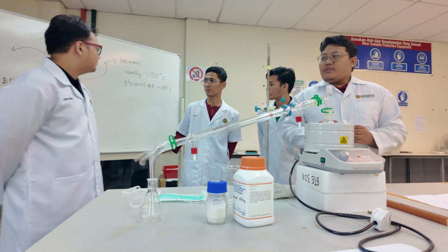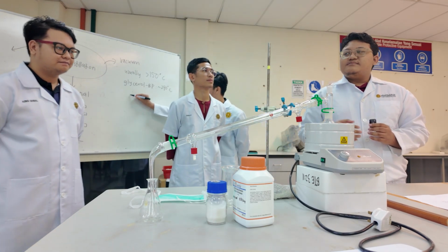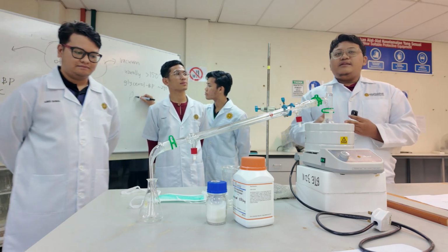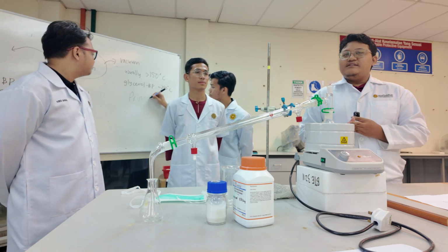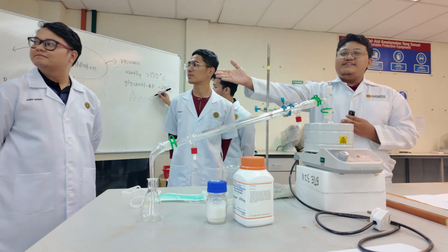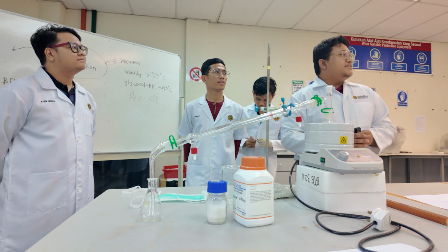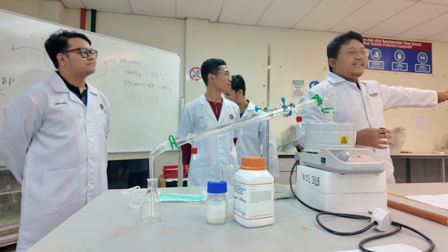And then about emergency preparedness. What we must know in emergency preparedness is the location of the fire extinguisher. And then, more important, the safety shower and eyewash station.